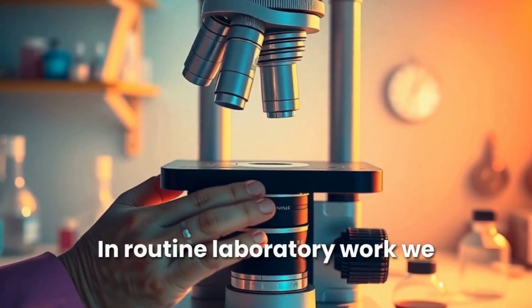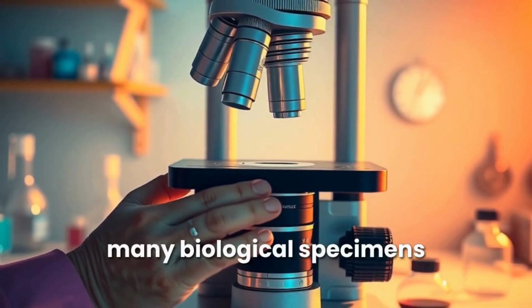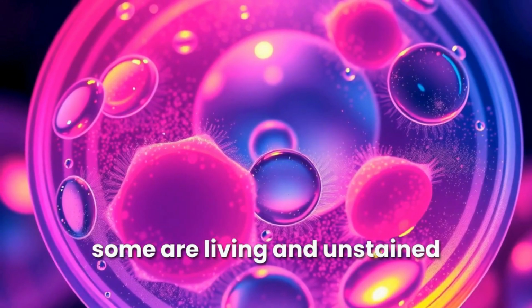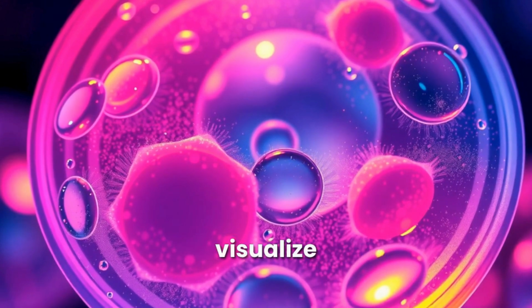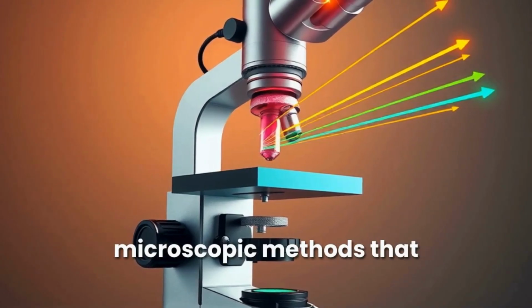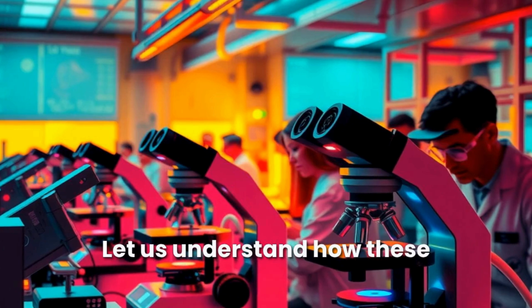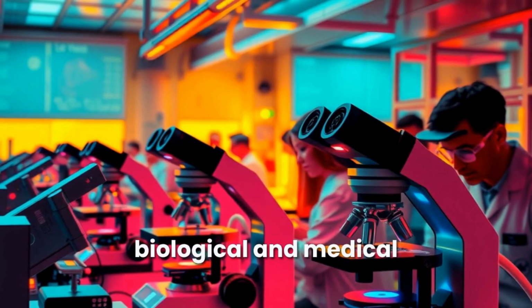In routine laboratory work, we often use the conventional bright field microscope, but many biological specimens cannot be studied properly with this instrument alone. Some cells are transparent, some are living and unstained, and others contain structures that require specialized optical techniques to visualize. Therefore, scientists have developed several modified microscopic methods that enhance contrast and reveal structures that would otherwise remain invisible.